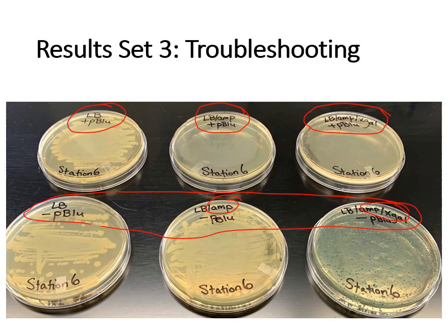I will point out again, because it's tough to tell in pictures, this is what growth looks like, this is what growth looks like, and those little spots that you can tell what their color is, hopefully, if you zoom in on your PDF slide, okay, those are all growth.